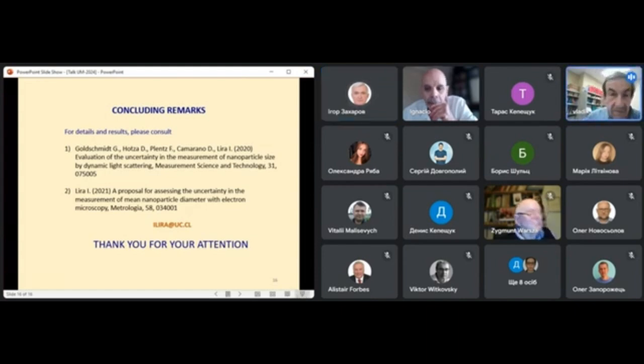Well, it's Vladik. Thank you very much for a very interesting presentation. The question is that when you talk about accuracy of pixel matching, you assumed, if I remember correctly, uniform distribution, right? When the part of uncertainty that is called pixel matching. The uncertainty of the pixel size? No, the pixel. So when you take into account the two different pixel, when you match the pixels on the sample and the pixels over there.